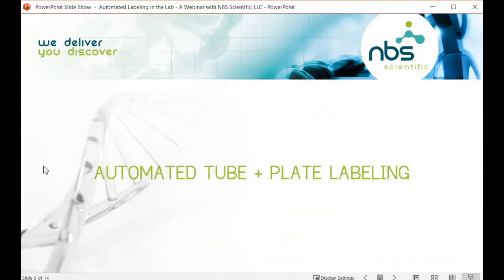So as I've mentioned, we offer a range of tube and plate labelers from Scinomix that can really help scale up your workflow and give you the walk-away time that you and your team would need to work on other more important tasks in the lab. So I'm just going to take a little bit of time to go through some of the labelers that we offer and just talk about some of their features and benefits.